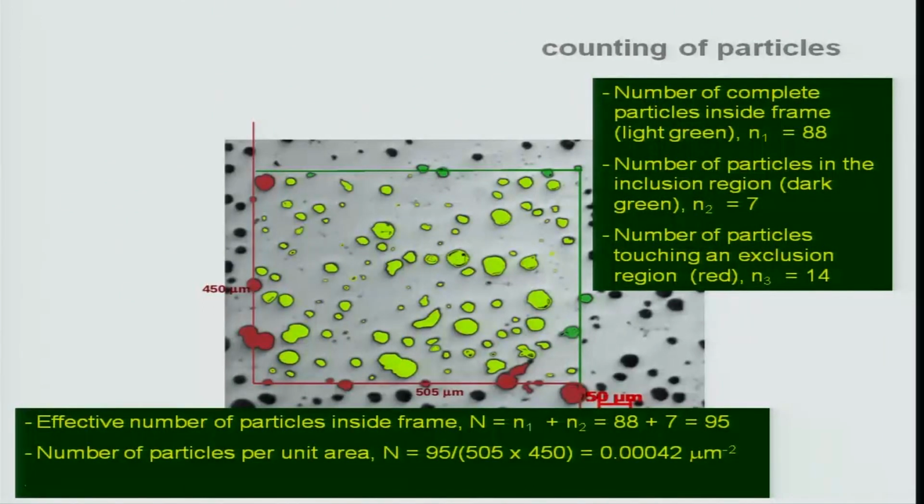So, this was a simple procedure for counting of grains and particles. With this, all my discussion regarding quantitative metallography is complete.